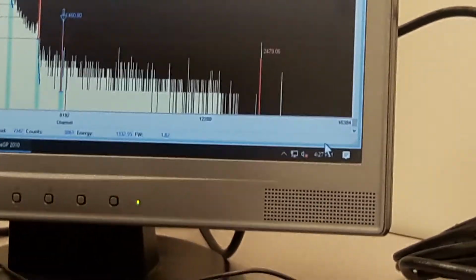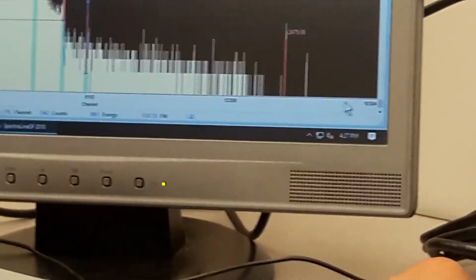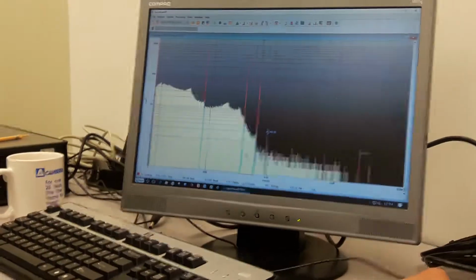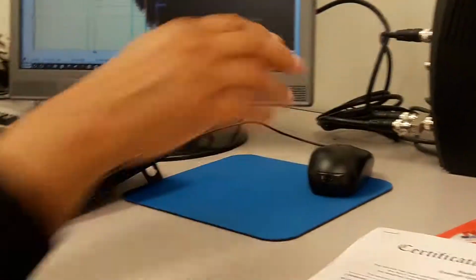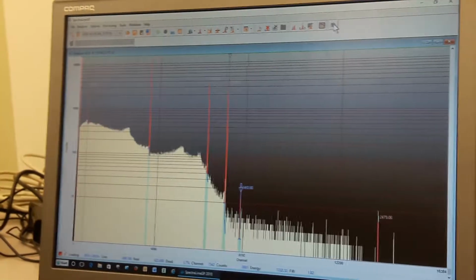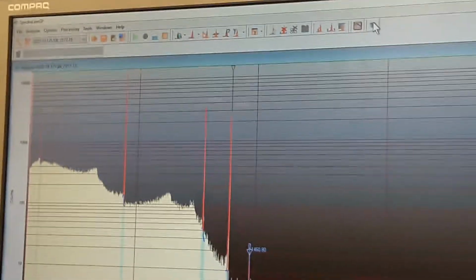The only way to find out is to see whether we have a problem with the calibration standard file that we will create. Once I have the date format set up, the first thing I want to do is to create an electronic version of this certificate, and by doing that I'm going to go to my certificate file editor, which is located in the top right hand corner of my software, which this manufacturer calls Etalon file editor. Etalon, I believe, is for energy test evaluation report or something.